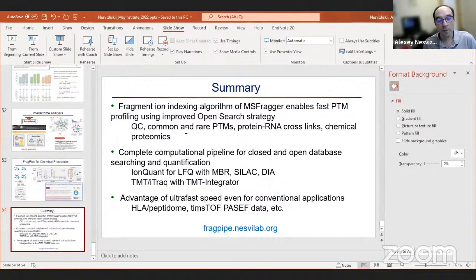Yeah, they are mutations. Open search will find them with some mass shifts, but we may not be very confident about them, and that's why they're not passing FDR, because we're pretty stringent. But it's big progress in how much we can identify now, especially with open and mass-tolerant search strategies. Still, there is more to identify with improved scoring, and with improved sequence database generation to capture those variant peptides and novel peptides.